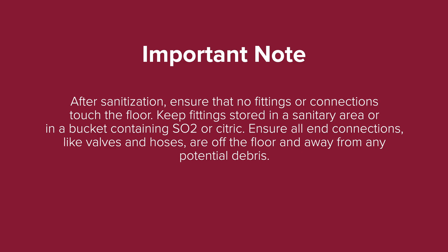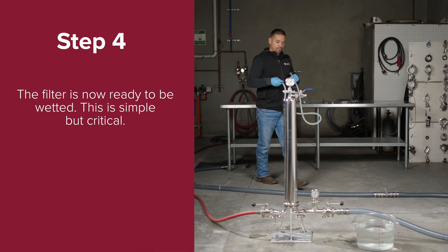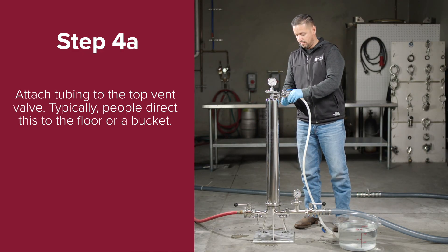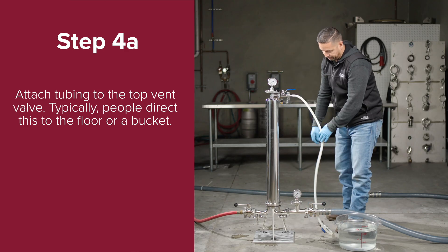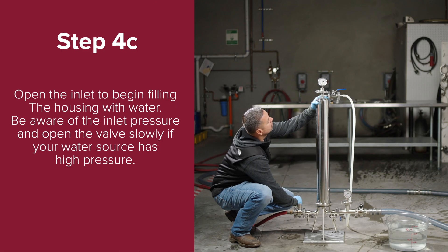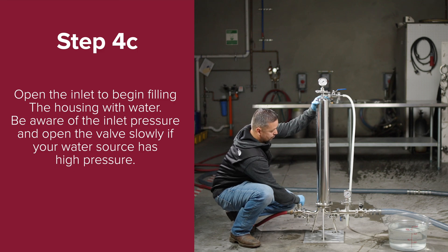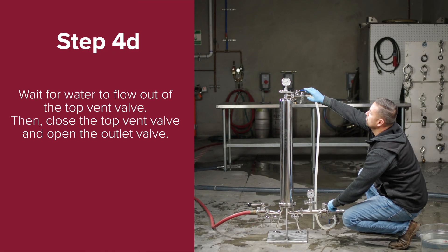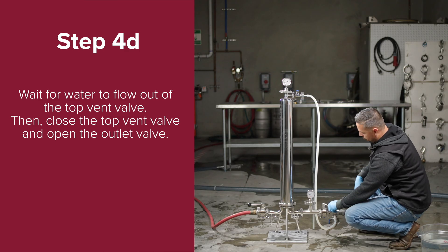Ensure all end connections like valves and hoses are off the floor and away from any potential debris. Step four: the filter is now ready to be wetted — this is simple but critical. Step 4a: attach tubing to the top vent valve; typically people direct this to the floor or a bucket. Step 4b: before you begin, the outlet valve should be closed and the top vent valve should be open. Water should be connected to the inlet but the inlet should be closed. Step 4c: open the inlet to begin filling the housing with water. Be aware of the inlet pressure and open the valve slowly if your water source has high pressure. Step 4d: wait for water to flow out of the top vent valve, then close the top vent valve and open the outlet valve.